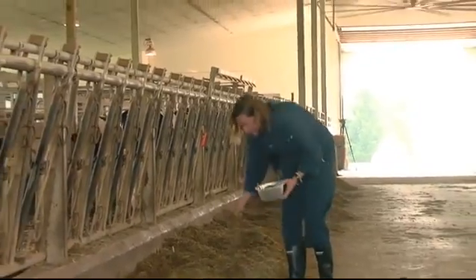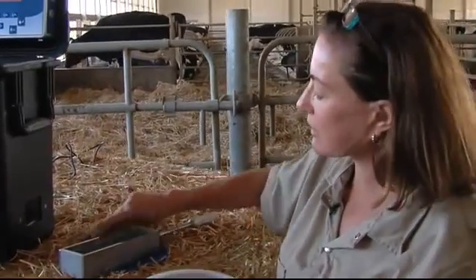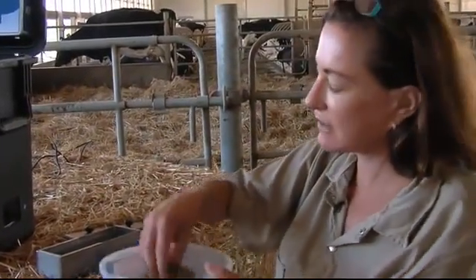When I turn the equipment on, I have to let it warm up and then I calibrate it. But at this point in time, I can go ahead and directly insert the sample.